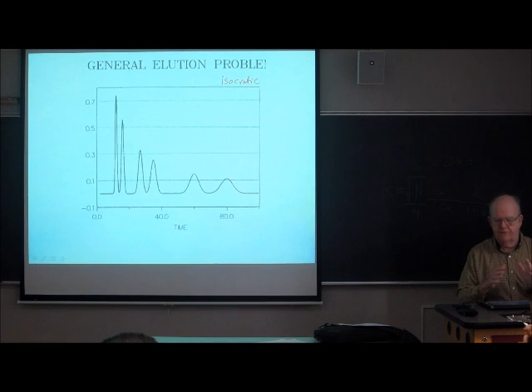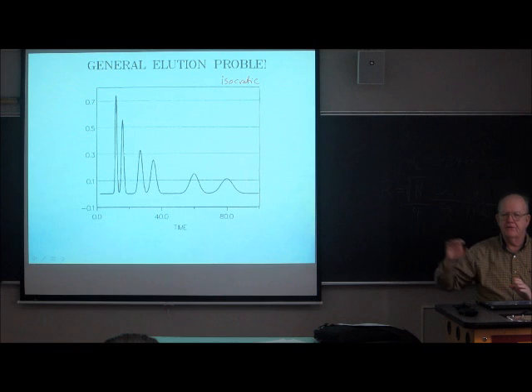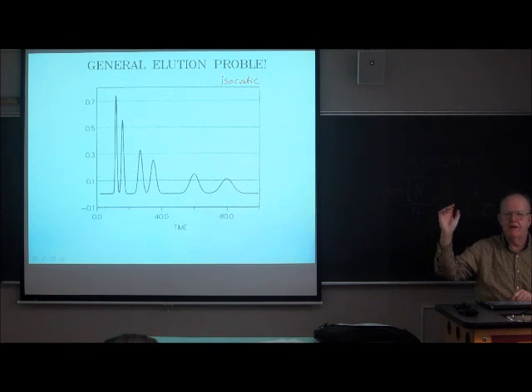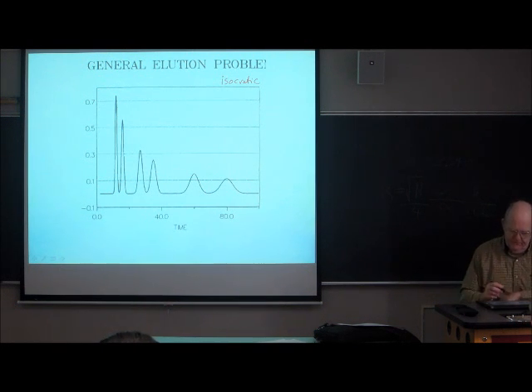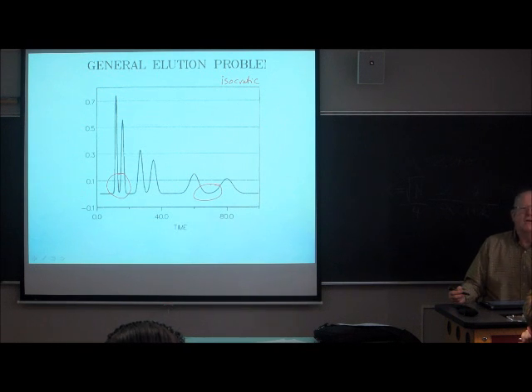And even if we assume the same number of plates for all the peaks, the later peaks come out and they're stubby and they're broad. And broad peaks are harder to integrate than our narrow peaks because you pick up more noise and they're not as tall as you'd like them to be. So here we've got rather well separated early peaks. I mean, we're virtually getting to baseline there. But in a sense, these later peaks are too well separated.